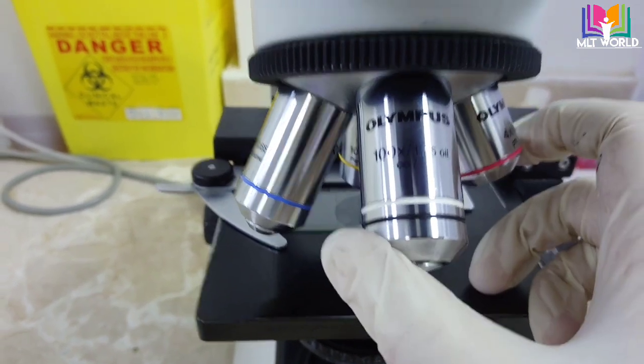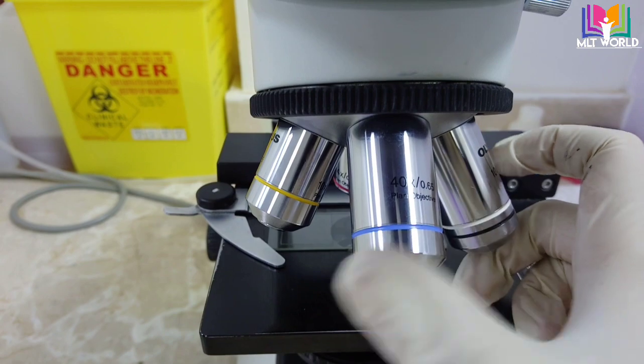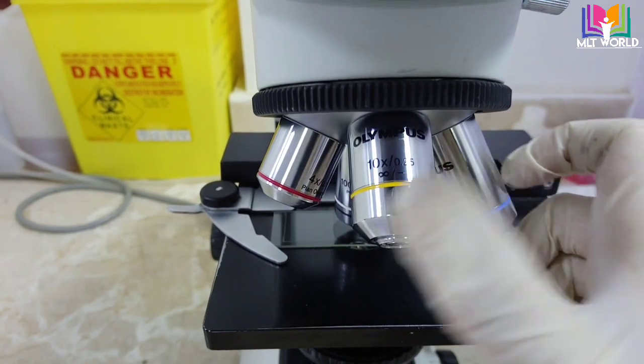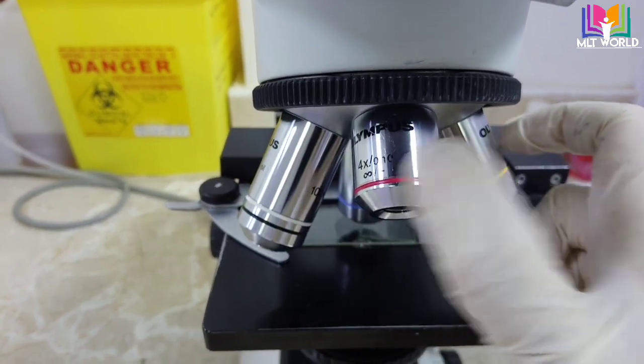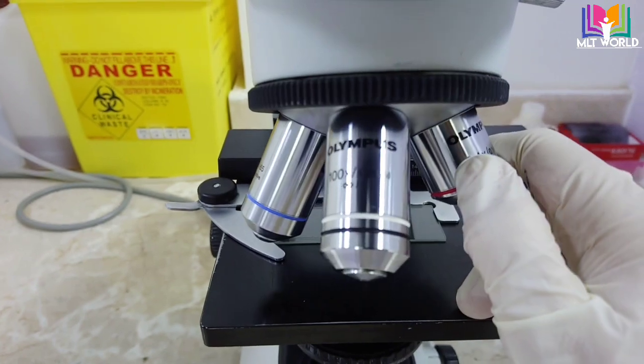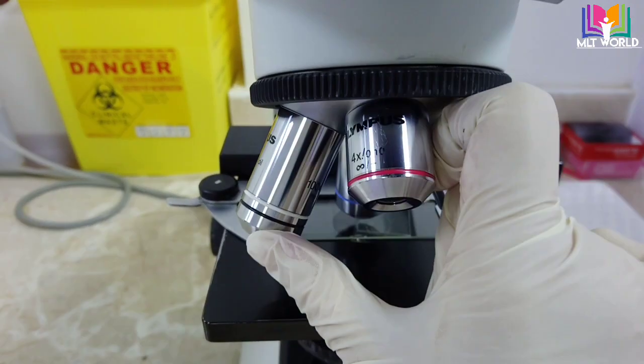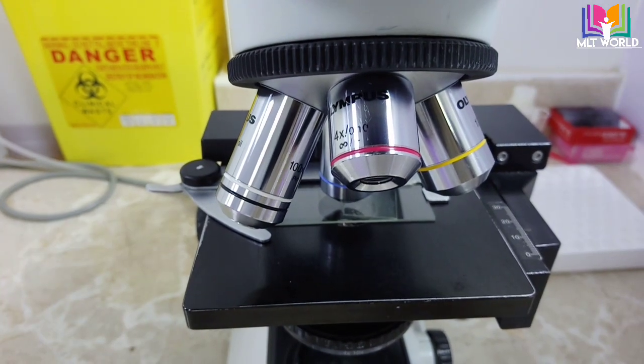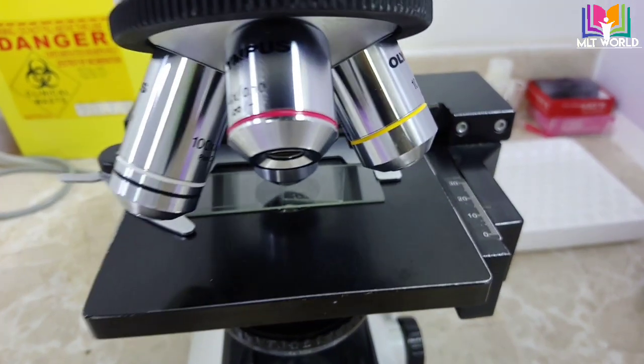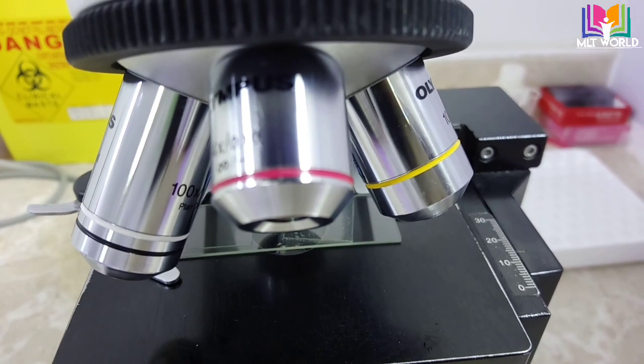When using blood smears and oil, sometimes these lenses become dirty if we have more workload. I will show you how easily we can clean the lens of the microscope. In routine microscopy, we use 10x lens, 40x lens, and 100x lens for oil immersion.